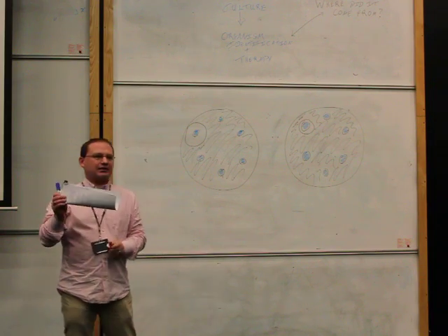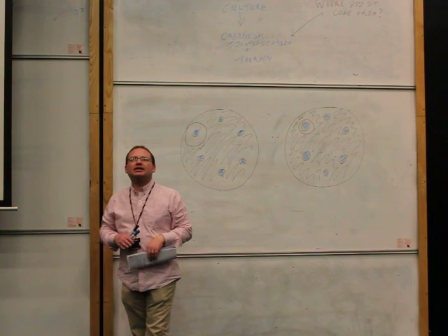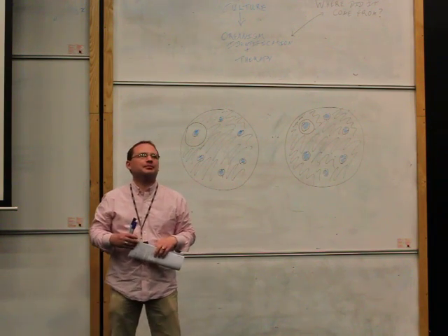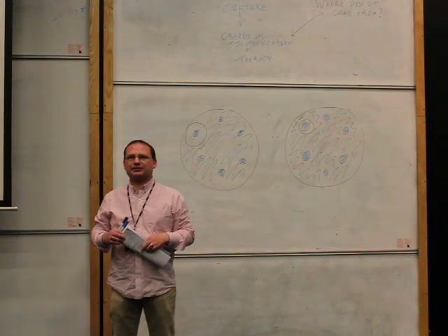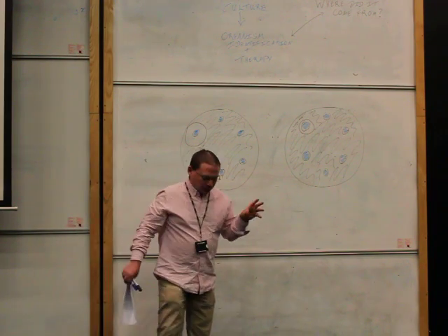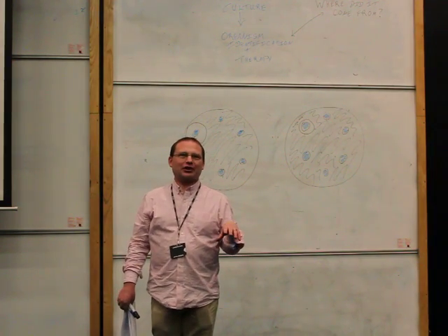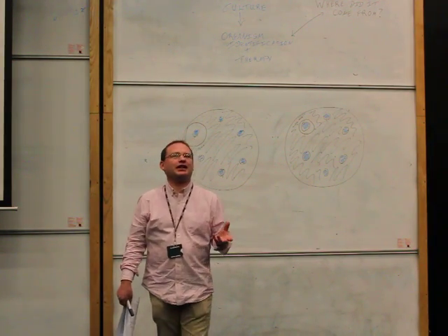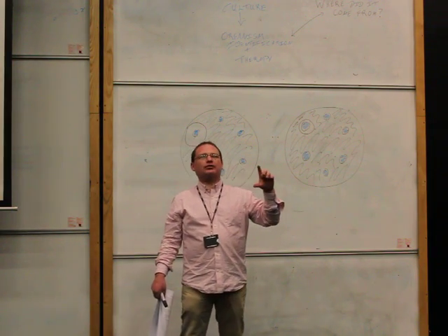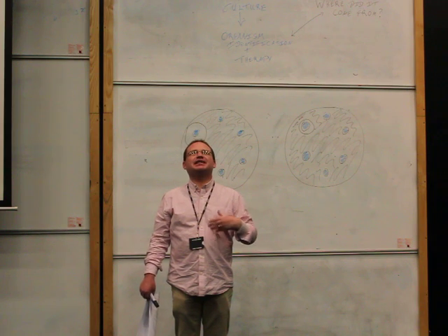I will be around in the laboratory with demonstrators and your lecturers to help you out if there are any difficulties. So you've measured those. Now, because we've taken pictures of plates, because you're no longer allowed to handle the real thing, you'll find that we have got a ruler in the pictures as well, so you can get a sense of scale.